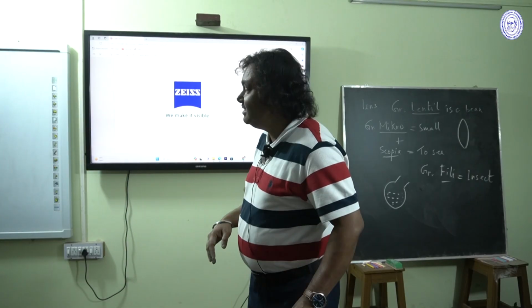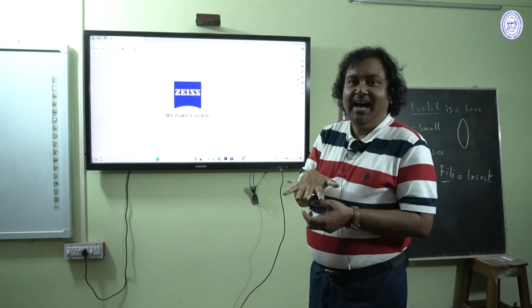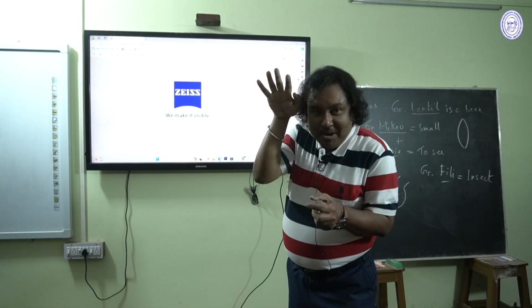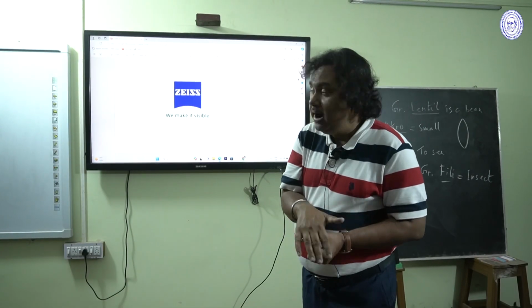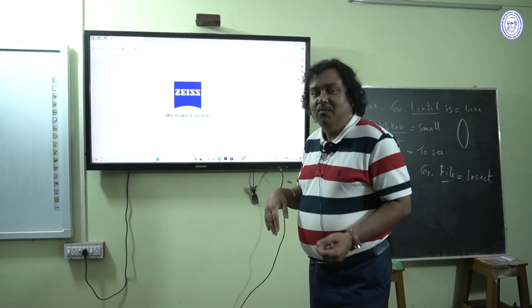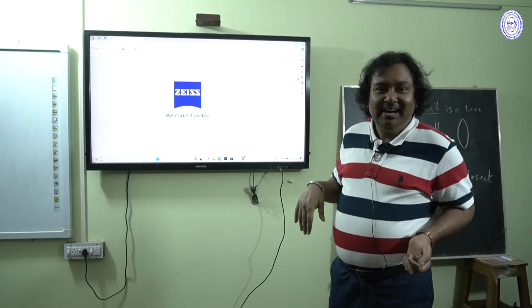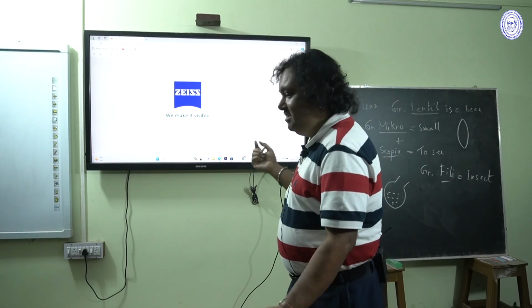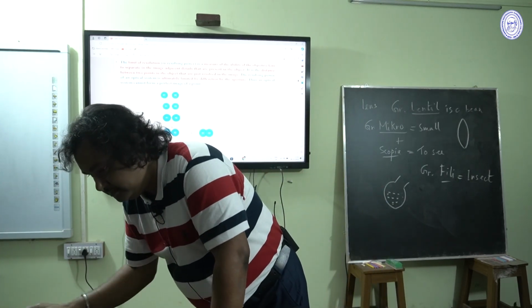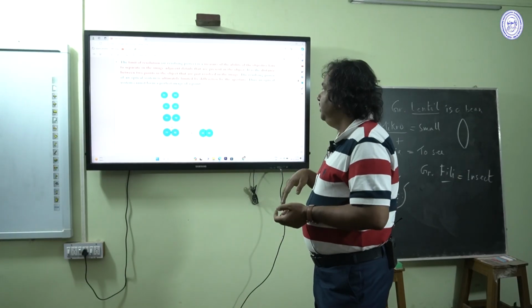Yeah, this is a Zeiss. This company is one of the best microscope manufacturing companies in the world. Carl Zeiss was an instrument manufacturer in the city of Jena in Germany, and their caption is, "We make it visible." This is for compound light microscopy.